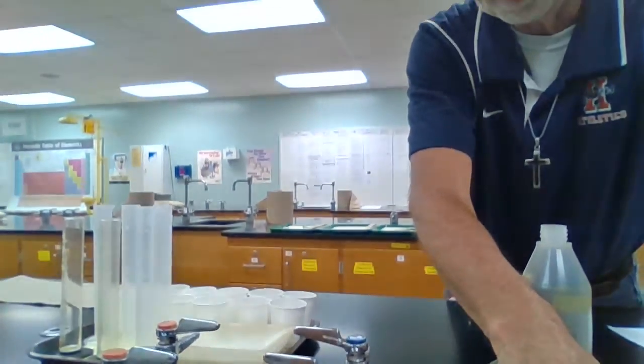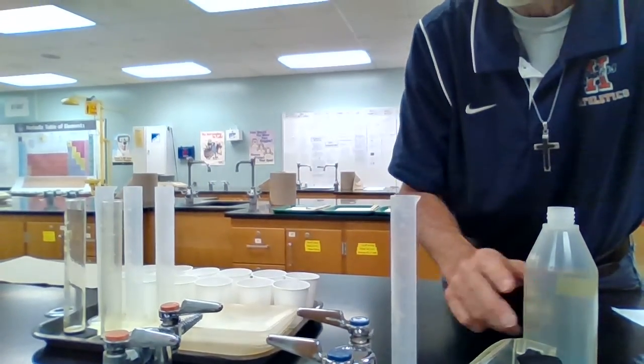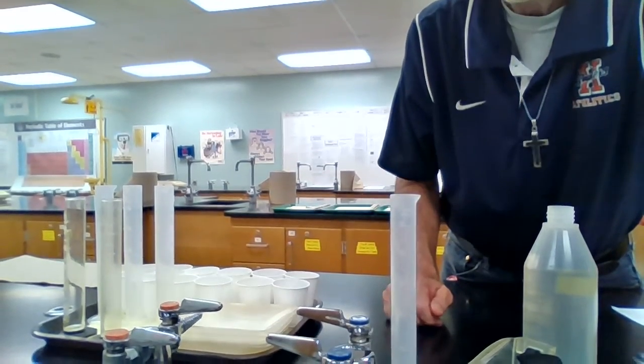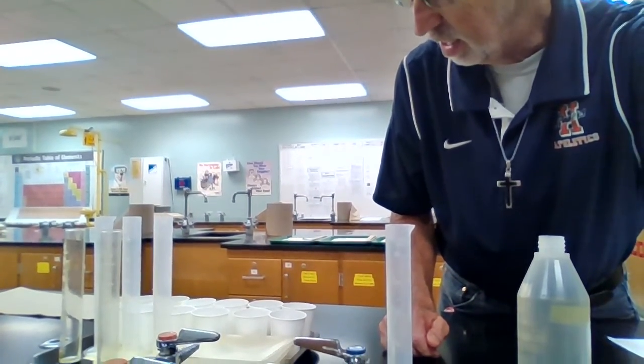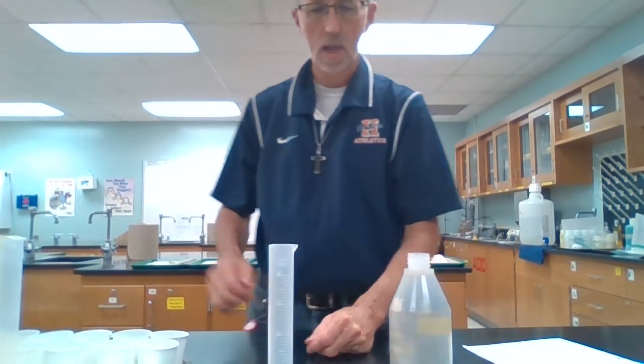Let me set this up here where hopefully you can see me. You can see I've got my electronic balance here. And over here we're going to need a graduated cylinder and some water. And then I've got the 6 samples of both copper and zinc in these cups right here. So let's see. Here we go. That seems reasonably good. All right.